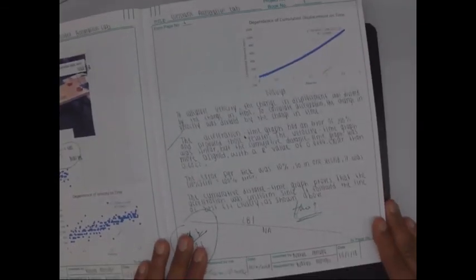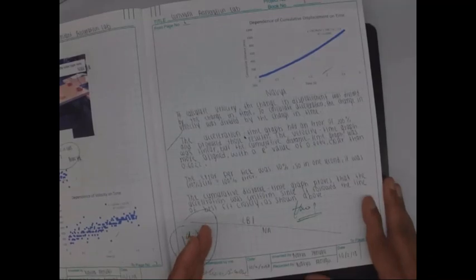So, as you can see, all lab notebooks are not totally clean. But they have to be maintained meticulously to show that the information was not doctored and is genuine.